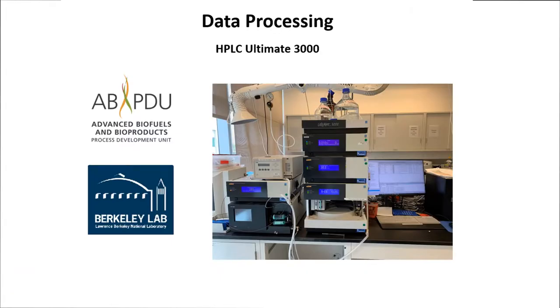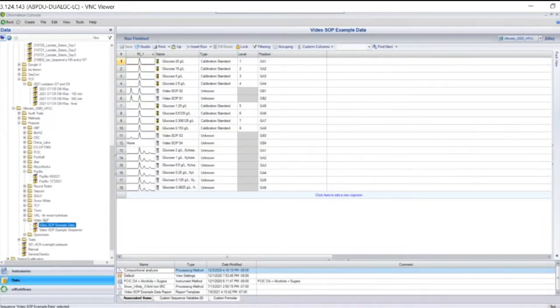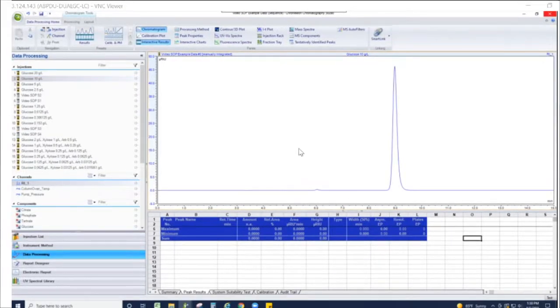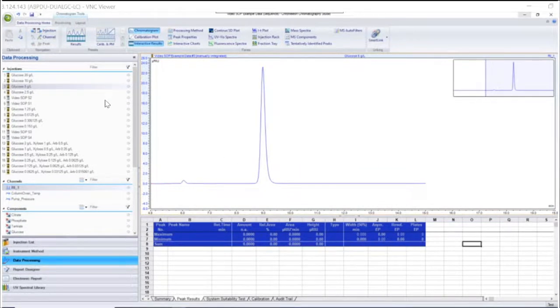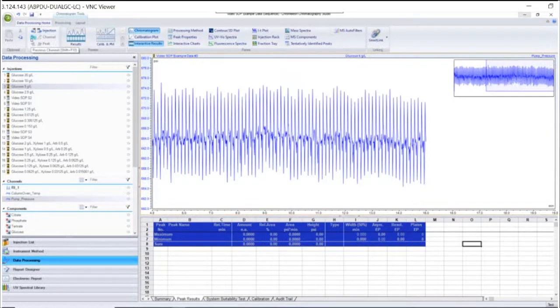To process data using Chromeleon 7, go to the Console and Data tab. Locate the desired sequence, open the studio, and it will bring you to an overview of the injection list. After that, select the Data Processing tab to view the chromatograms. Using the Previous and Next buttons in the Navigation tab, you can swap between injections. You can also swap between channels of data by using the Previous and Next buttons.